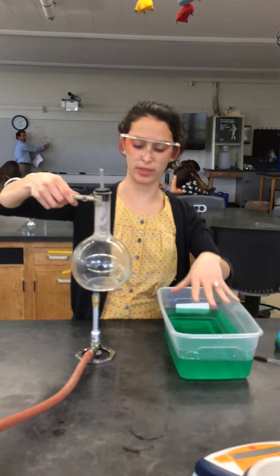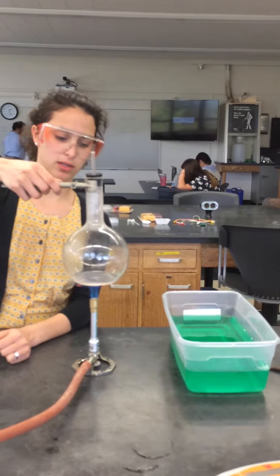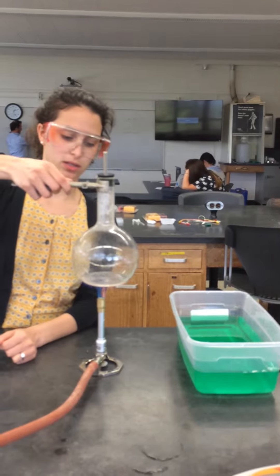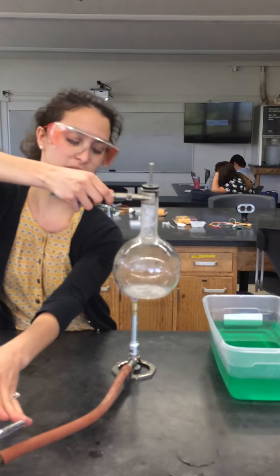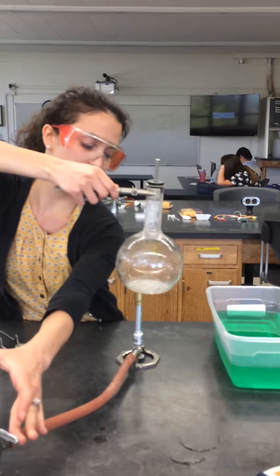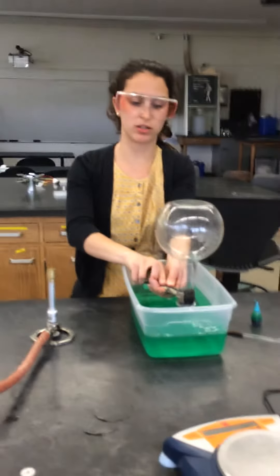And this is cold water, by the way. It's boiling, it's creating hot gas — hot water vapor into the round bulb flask. And I'm submerging it into the cold water.